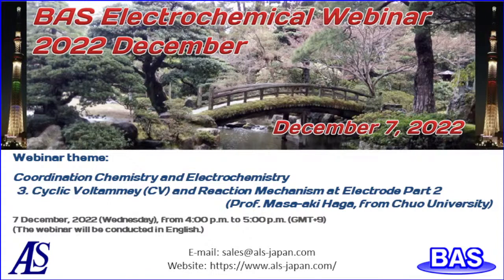Today, it will be the third lecture of a series of lectures in the field of coordination chemistry and electrochemistry, introducing basic electrochemical methods and electrochemical applications with a focus on organic complexes, introduced by Professor Masa-aki Haga from Chuo University. Today's theme is coordination chemistry and electrochemistry, cyclic voltammetry, and reaction mechanism at the electrode, Part 2.